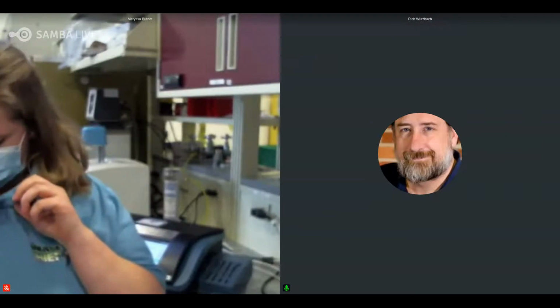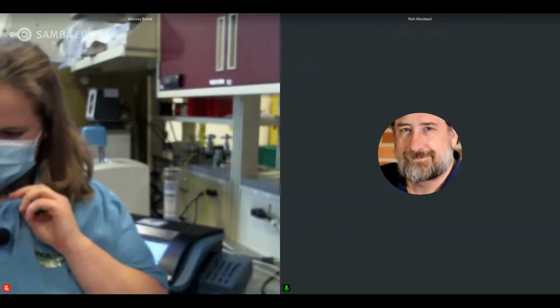And then a follow-up question to that would be, is there a way to check the background levels of the vials with the device itself? The background moisture level that might be in an empty vial.